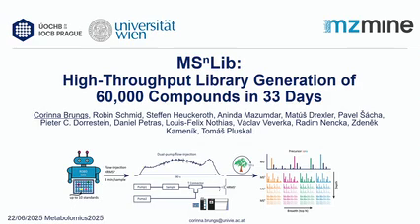Thank you, Tito. So the next step, or the last part in this workshop, we wanted to show you the library building workflow that we are working on in mzmine as well. I guess most of you that do untargeted workflows know it's an issue to annotate the features in your sample set. So that's why we think it's very important to build the library, make public databases bigger, and that we all need to work together. So you see already that we have a lot of groups and people being collaborative, sharing compounds or sharing ideas on how to build the libraries in mzmine and what to think about.